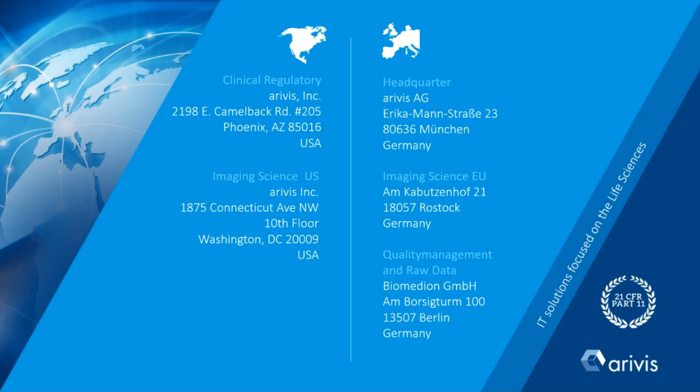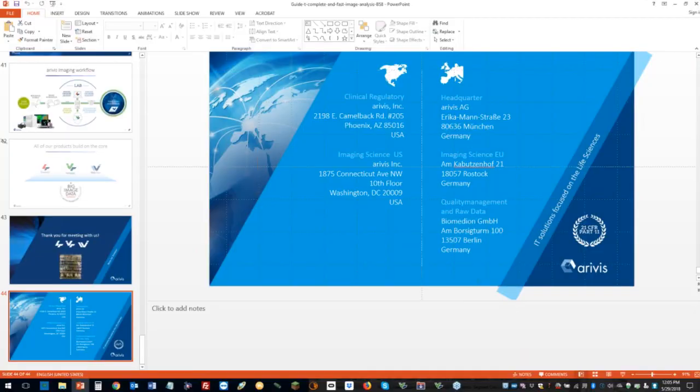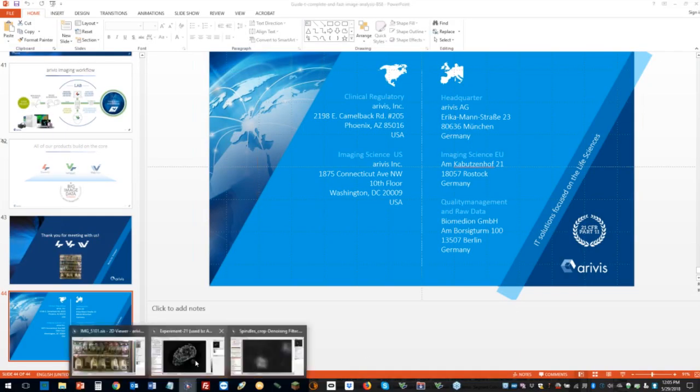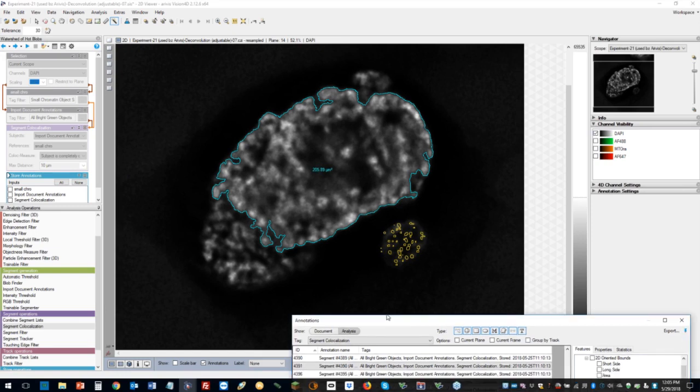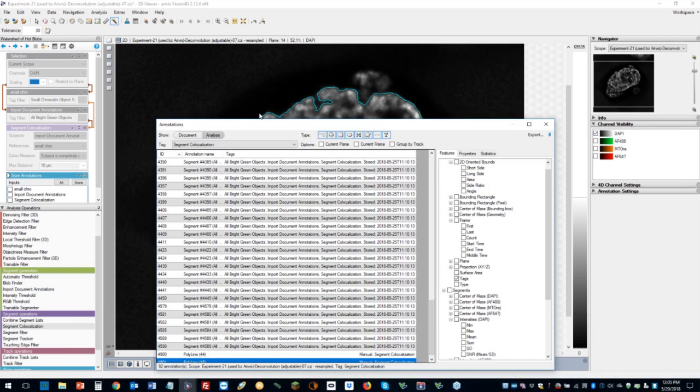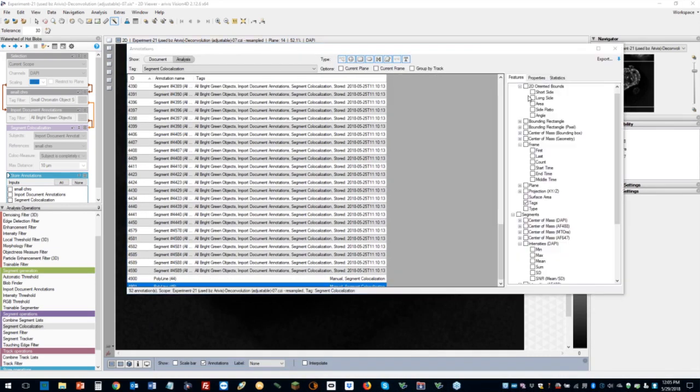I would say definitely not directly. So what we would do is something like, let me show you. If I go to this, we've got lots of objects, and we compute lots of different properties for the objects. So we compute things like their length, their aspect ratio, their position in X, Y, and Z.